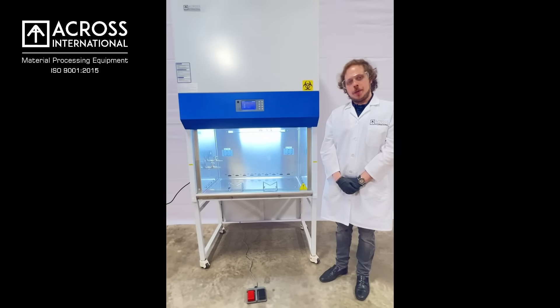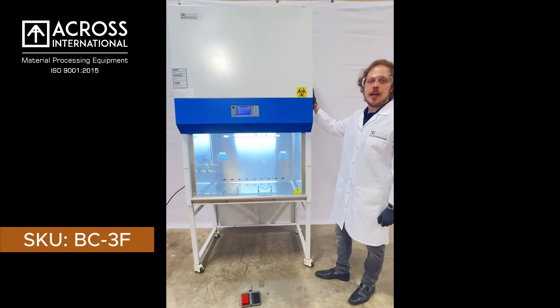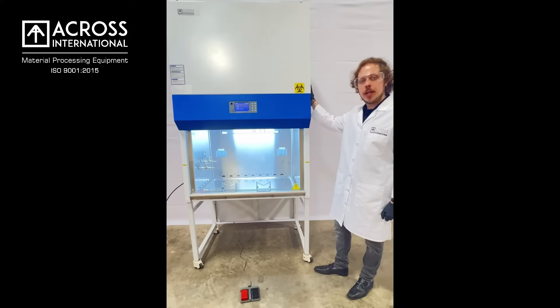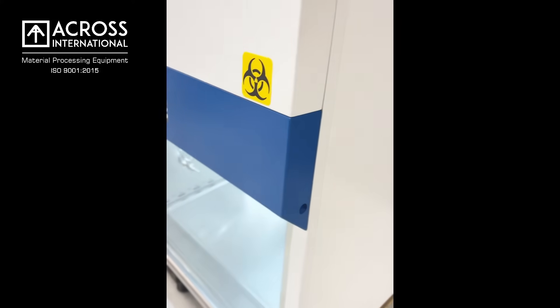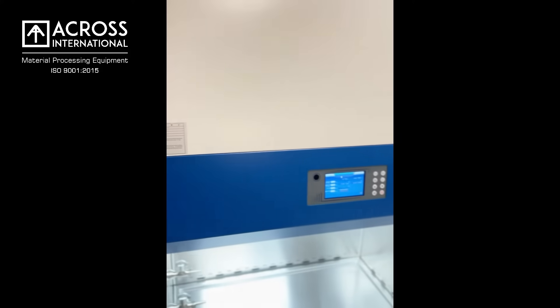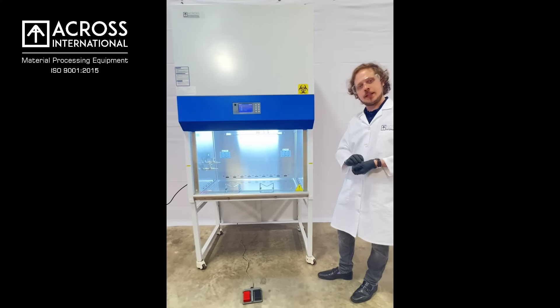Hello, this is Maxwell with Across International, here to demonstrate our NSF certified Across International biosafety cabinets. Biosafety cabinets are an essential tool when working with biohazardous samples, and these Class 2 Type A2 biosafety cabinets not only filter the air going into the cabinet so that your samples are protected, but also the air removed from the cabinet so that your lab space is protected.